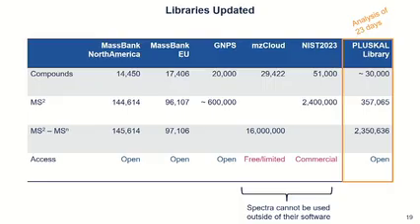And with our effort, we see that from the 38,000 compounds, we could detect about 30,000 combining positive and negative mode. And we get more than 2 million MSn spectra out of it, which I think already shows what we can actually get. In our case, we use flow injection, so super fast. That's why we only needed 23 days. But it shows how fast we can actually increase the databases in the public domain.